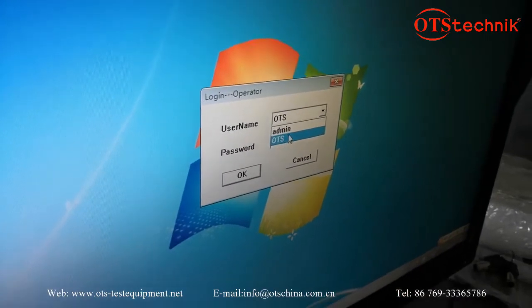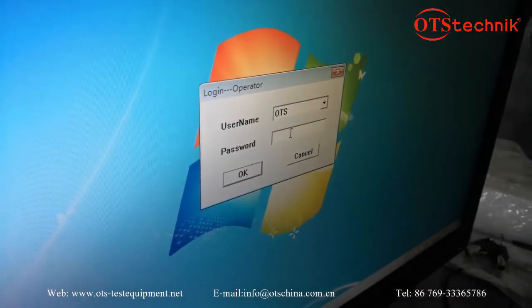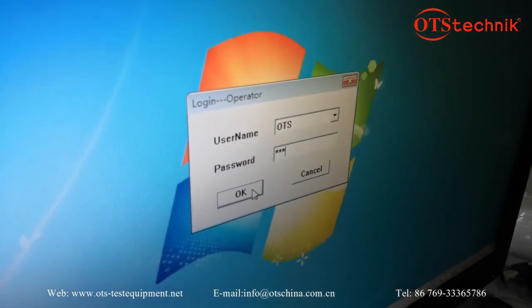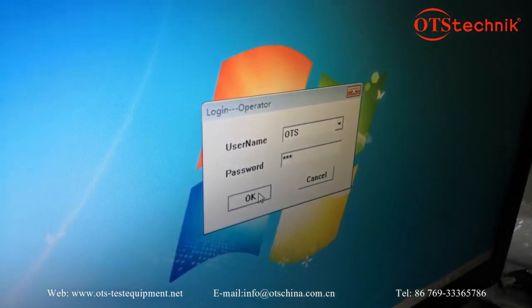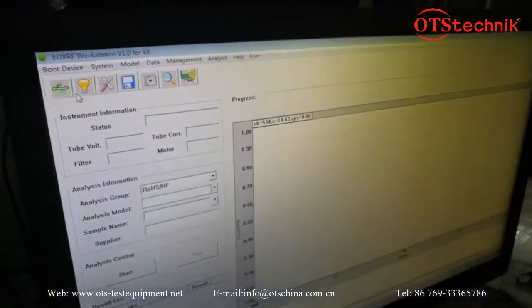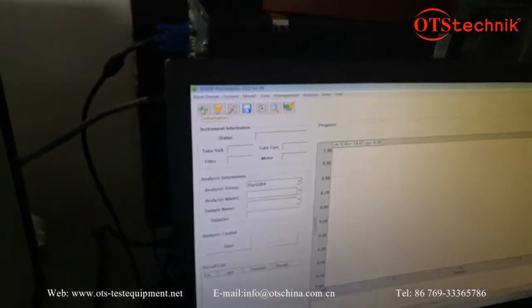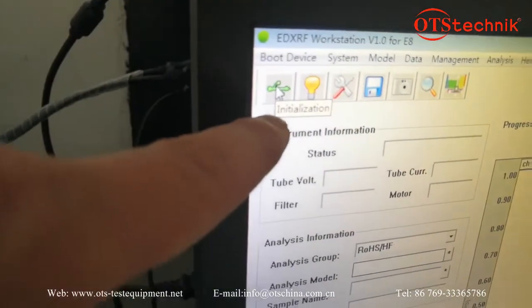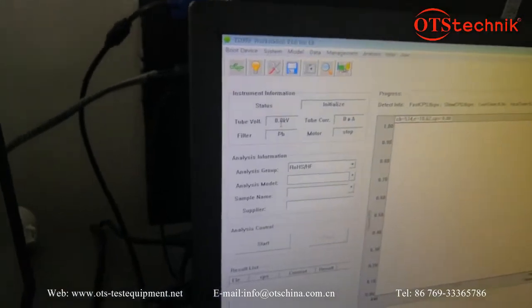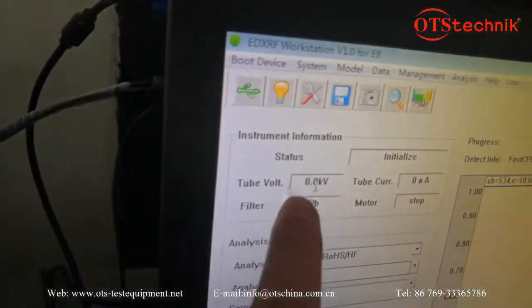Enter the username and password. Just input the password — the default password is set to '123'. You can also change it yourself. The first time you connect, click this button to prepare for testing. You can see there are some parameters shown.